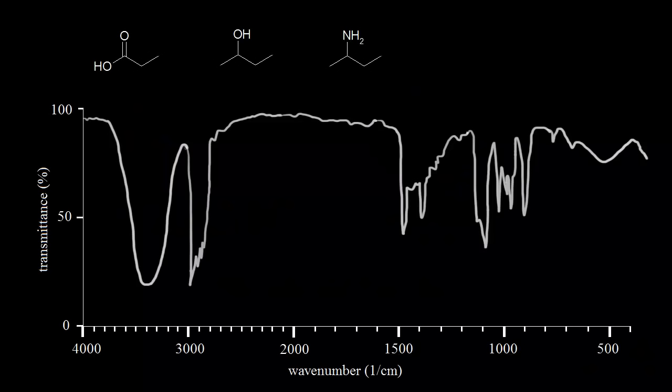Let's look at some practice IR spectra. So here we have three molecules, a carboxylic acid, an alcohol, and an amine. And below there's an IR spectrum of one of these molecules. So let's figure out which molecule has this IR spectrum.